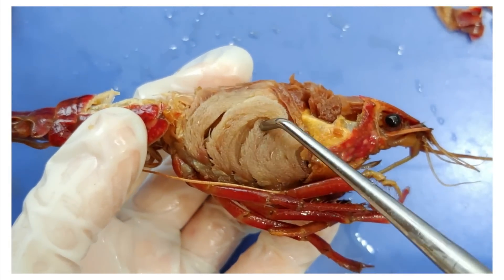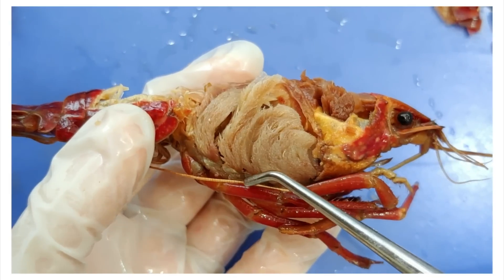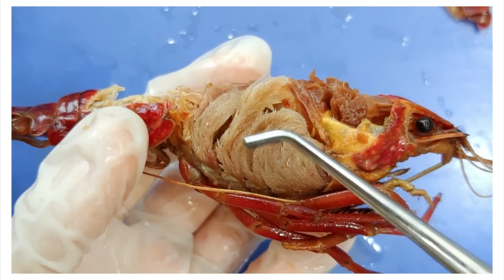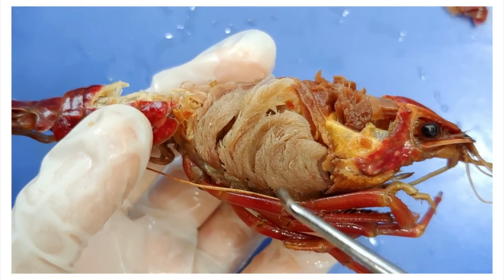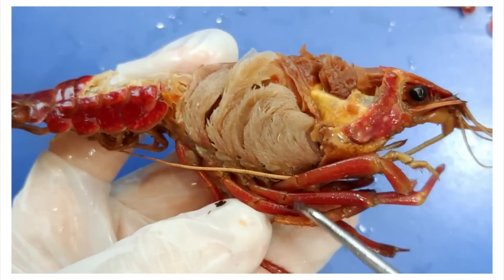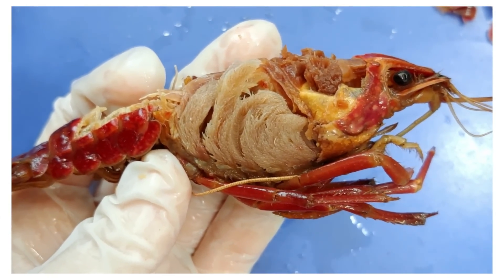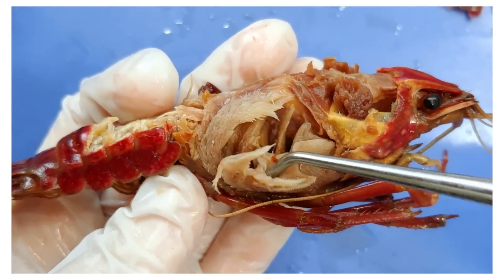Now the first thing you see here — these feathery things are the gills. The gills participate in gas exchange, which means it both absorbs oxygen and removes carbon dioxide. You may notice that the exoskeleton covered the gills, which makes it hard for it to do its job because it can't access much water. But evolution did the crayfish a real solid by attaching its gills to its legs, as you can see here. When the legs move, the gills move with it, stirring up the water and allowing freshly oxygenated water to enter under the exoskeleton. The gills are really feathery for more surface area, which is always important for gas exchange.